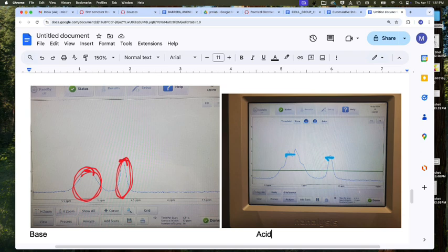Is the height truly what integration is? What is integration? The area under the curve. Which means we've got to bust out our calculus skills, and you need to fit this to a calculus curve to tell me the area underneath that curve.